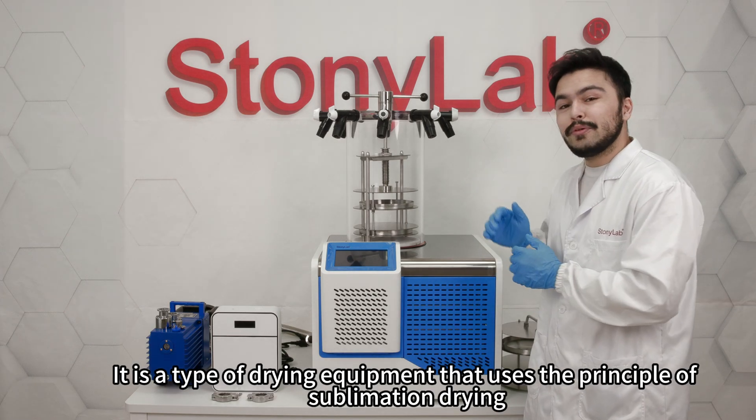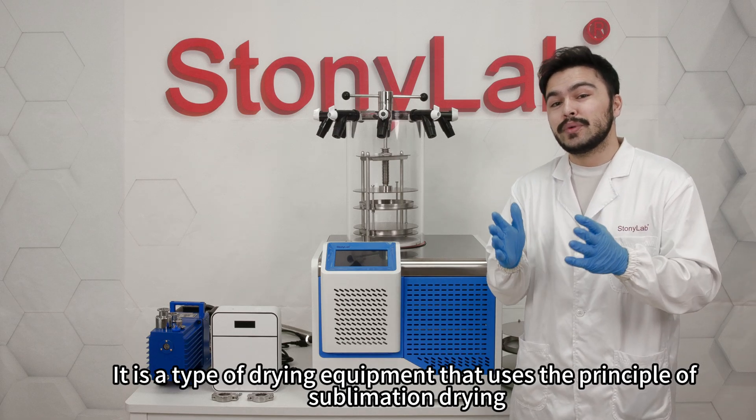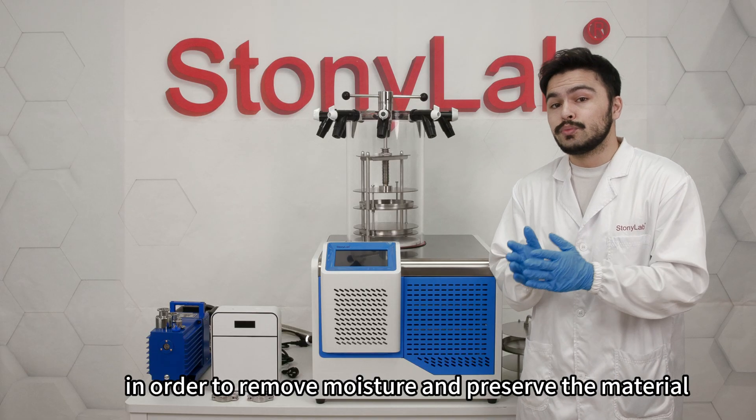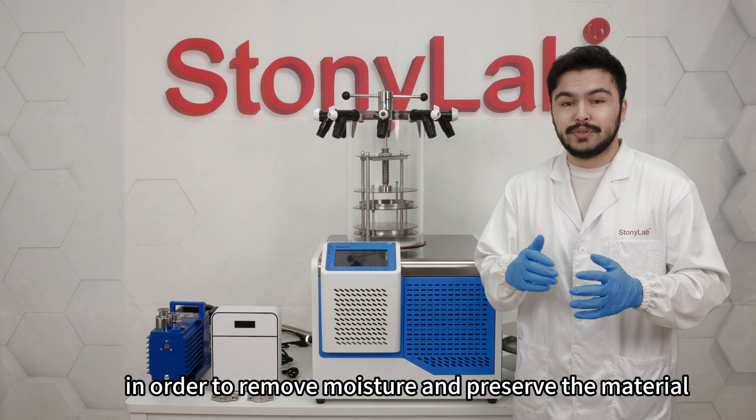It is a type of drying equipment that uses the principle of sublimation drying, where the water content is sublimated from solid to gas under high vacuum conditions in order to remove moisture and preserve the materials.